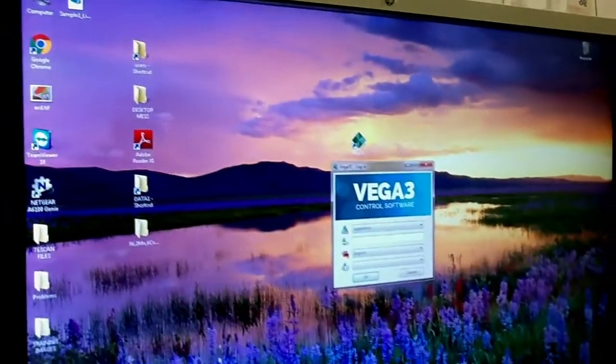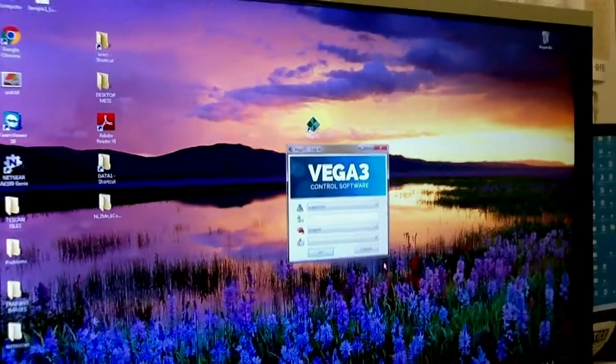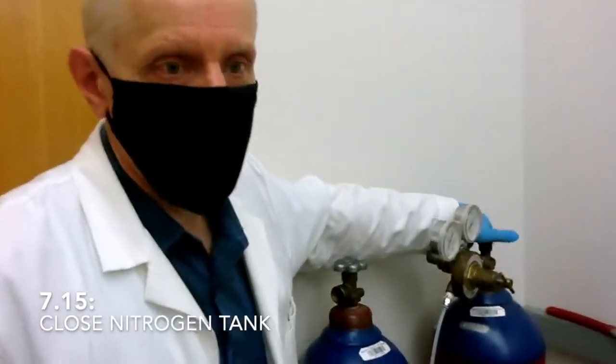You can leave this window on and close the nitrogen gas tank. This video was basic training for the usage of the TESCAN SEM. This is what you should normally be expecting, but if you run into any problems, look for me in room 010, give me a call, or send me an email. If I'm not around and you cannot solve the problem, just cancel the session.